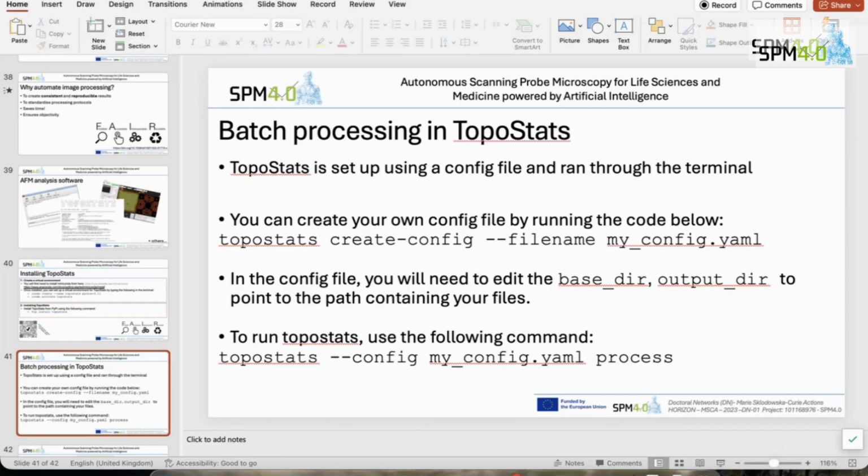Just mine, on YAML. We can change it. So where it's in my config, you can comment and change. It should create the file in the directory you're in, but it depends what directory you're in. You could create a directory, yeah. You can change directory. That makes more sense.